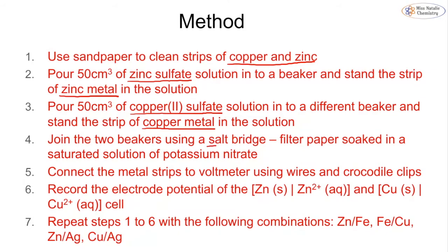We join the two beakers using our salt bridge. So this is our piece of filter paper soaked in our saturated solution of potassium nitrate. And then we connect the metal strips to the voltmeter using our wires and our crocodile clips. We should then see an electrode potential or a voltage on our voltmeter, and we then note that down. And that is for our zinc-copper cell. We then repeat all of these steps with our different combinations: zinc and iron, iron and copper, zinc and silver, and copper and silver.